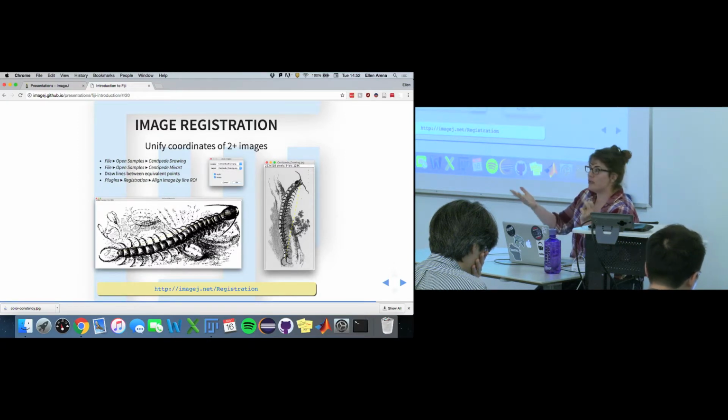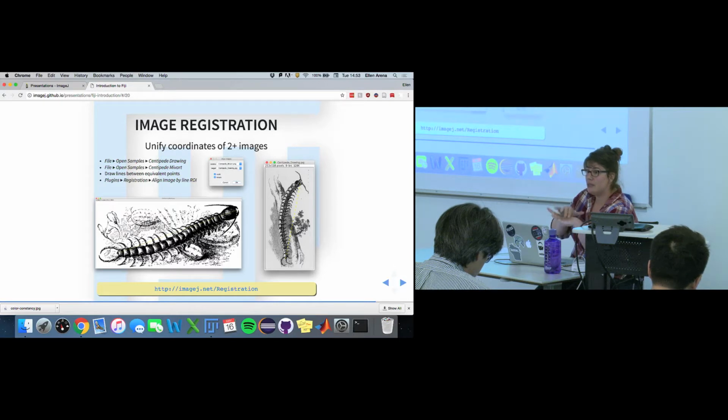A lot of you, I'm sure, have heard of light sheet microscopy. You're taking large 3D volumes from multiple angles, and a lot of times they embed beads in those samples. So from each angle, they use the beads inside as their coordinate system to overlay the images.